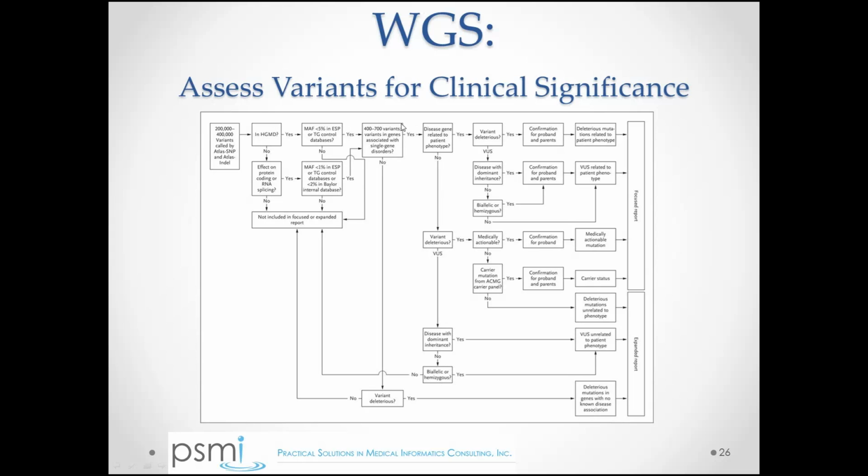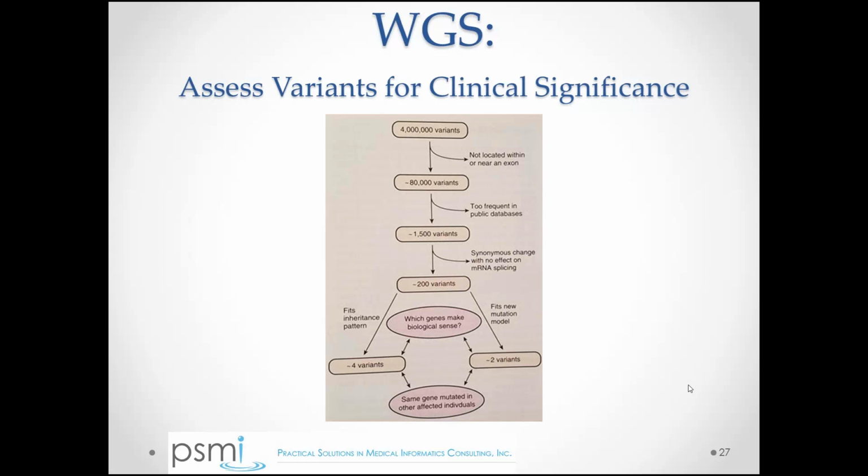And they went through a particular filtering to ultimately try to identify the causative variants. And I think that, again, I show you this because it was used in real clinical practice. But what I'm going to do now is show you a bit of a simplified filtering method that we're going to walk through for our case, really more as an illustrative scenario.